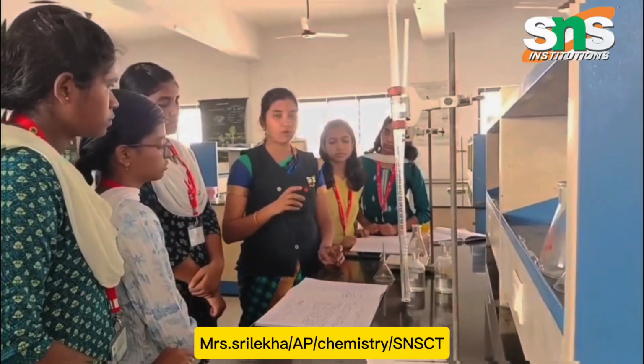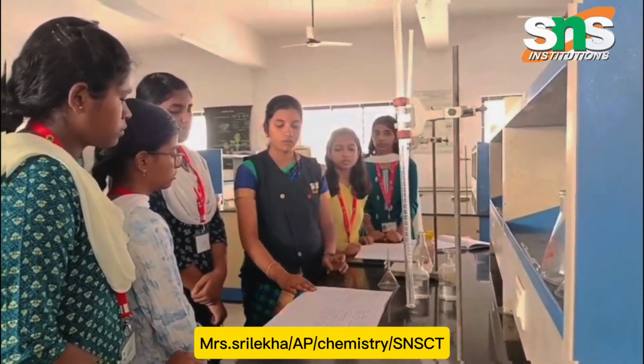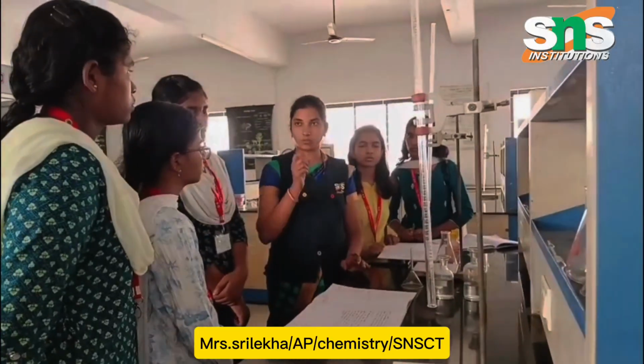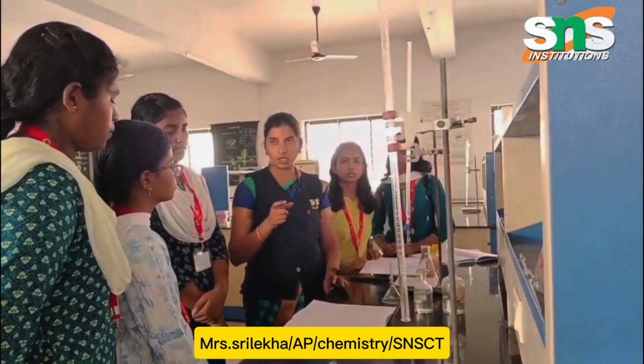By using this formula, we can substitute the values by V1 N1 equal to V2 N2. Here we know the N of the solution. For substituting V1, we multiply by the concentration, 0.2. Okay, so we are adding.